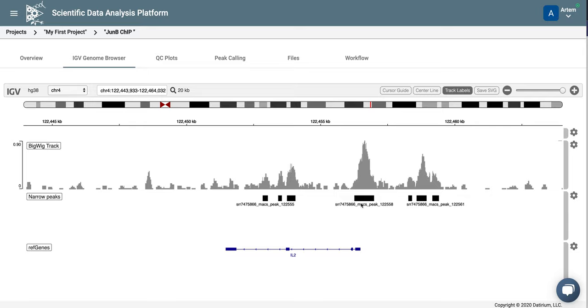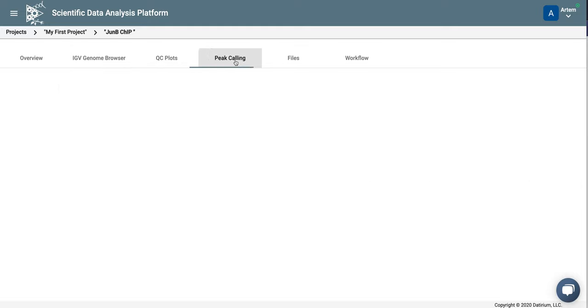You can see that these are the peaks that MACS2 found to be significant here. And you can also see the list of peaks in the peak calling tab, which shows the table with all the peaks.